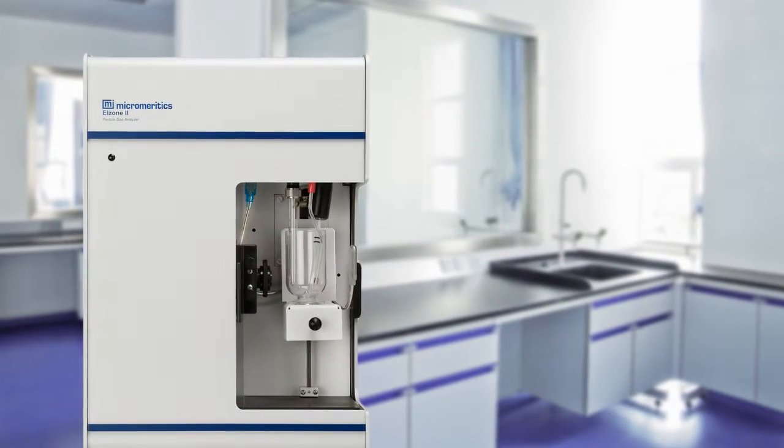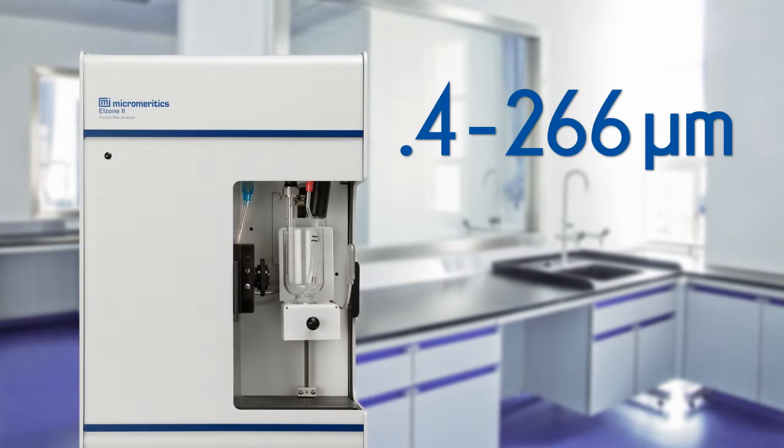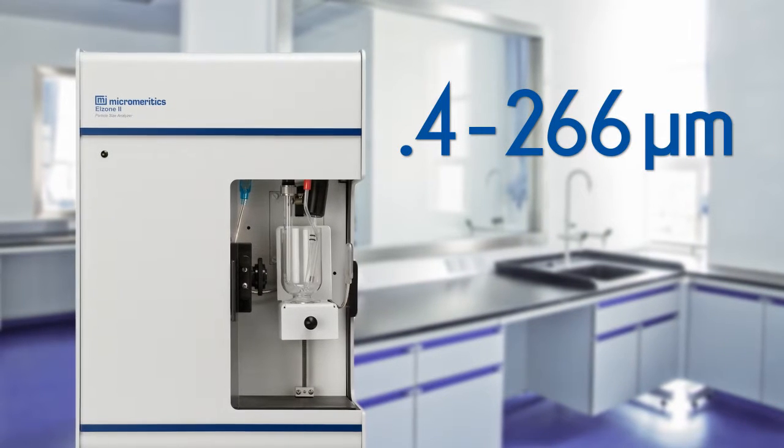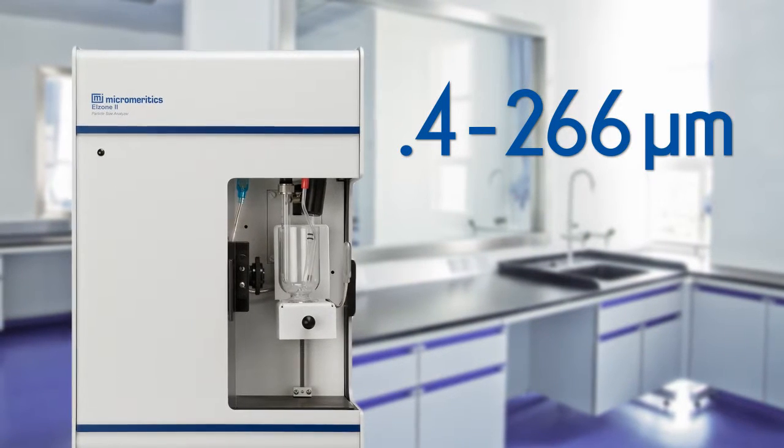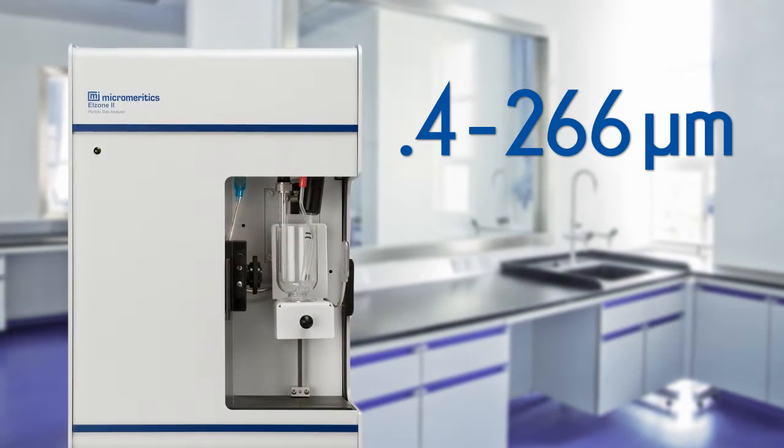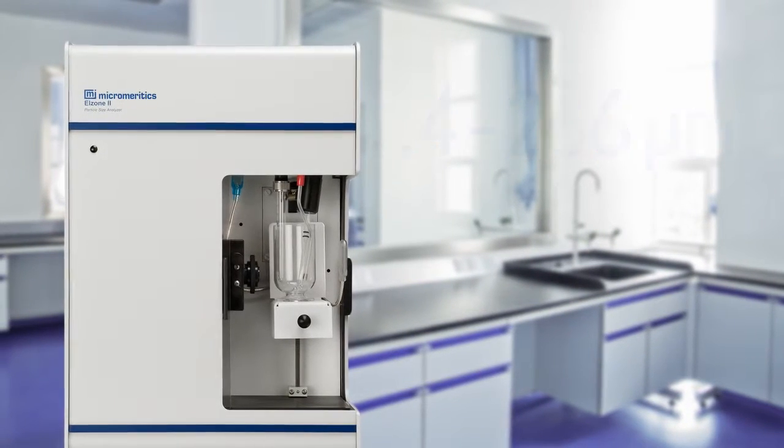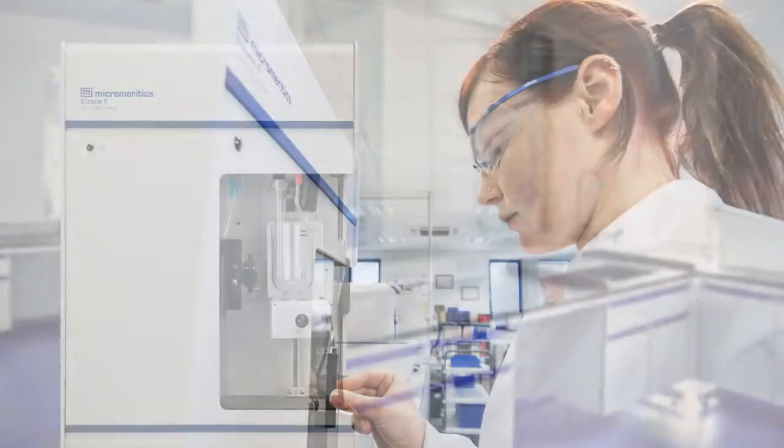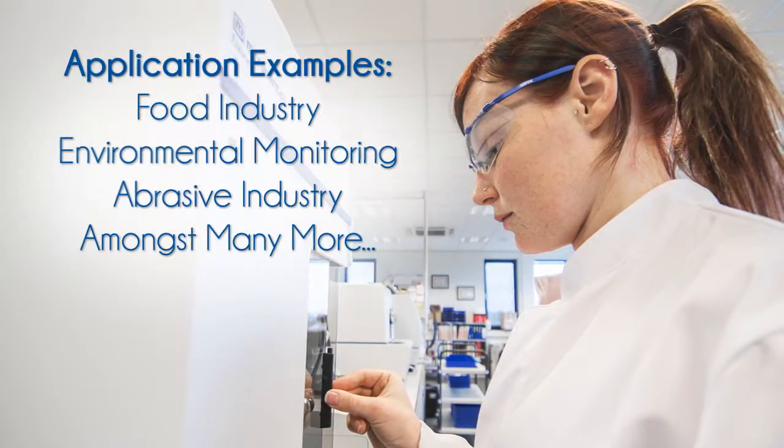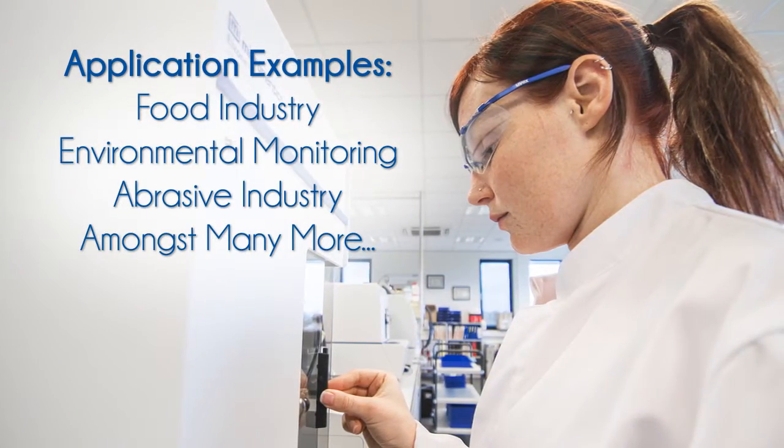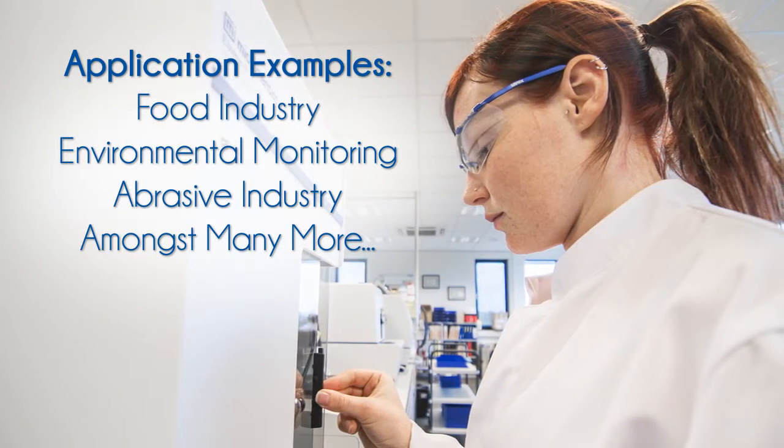And a wide variety of orifice tubes to bring the highest level of resolution and accuracy possible to a tabletop particle size analyzer and particle counter.